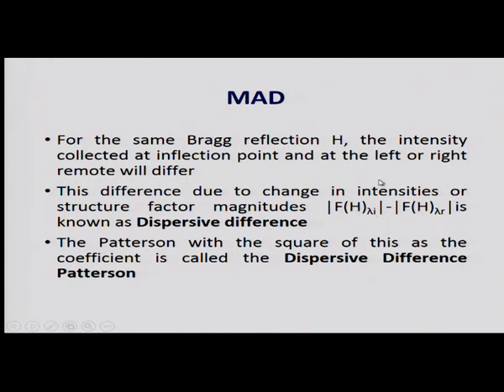For the same reflection, when you go to another wavelength, where we have the equivalent of physical substitution by changing f prime, we have a different value. So, since this is the same reflection, and this is also the same reflection, but the values differ, I can use this as the coefficient, do a Patterson, and this is known as dispersive difference Patterson.